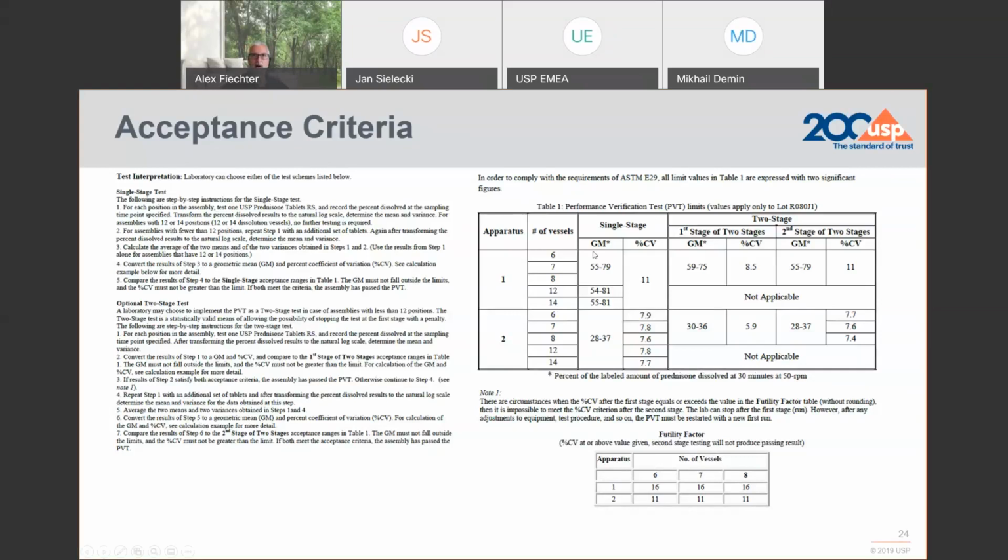And what you are having to meet is up here. If you have a 12 or 14 position tester, a large equipment, you only have to do one test within that single stage test and apply all the 12 results or 14 results that you have to this specification. This is for apparatus 1 and apparatus 2.